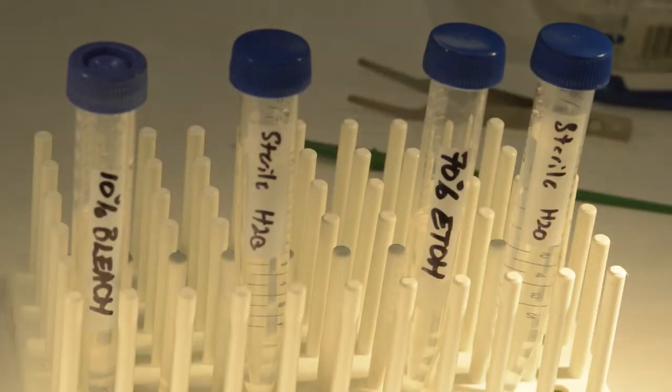You will be dipping a beetle into 10% bleach for 3 seconds, then 10 seconds in sterile water, then 5 seconds in 70% ethanol, and then 10 seconds back in sterile water.